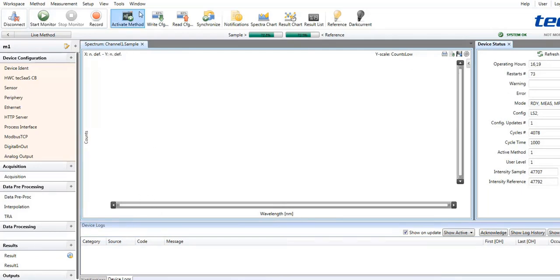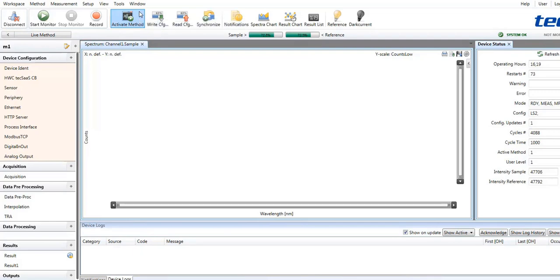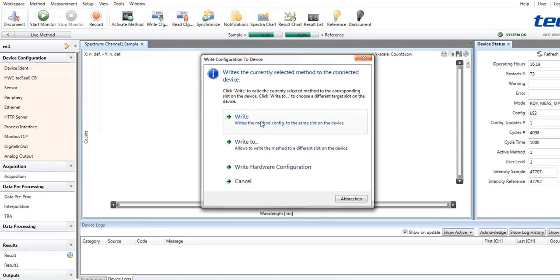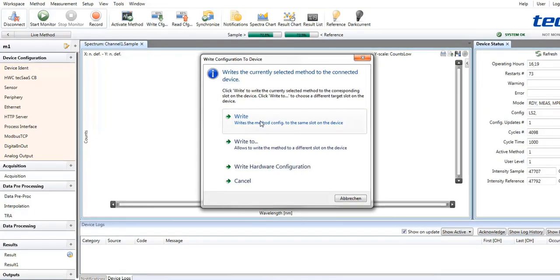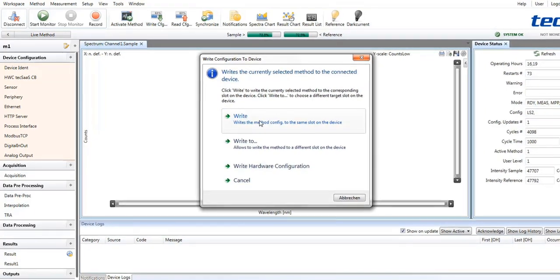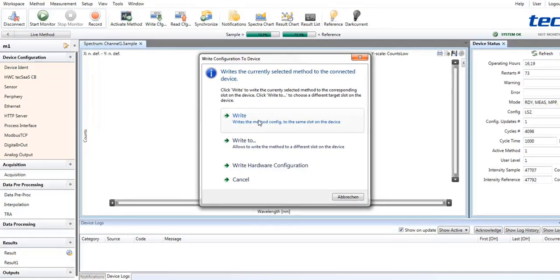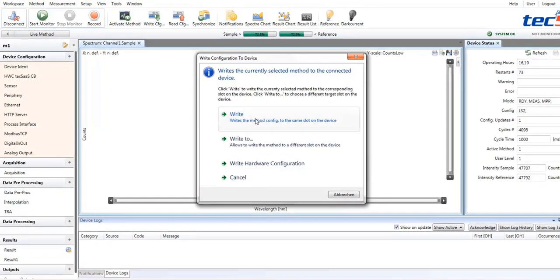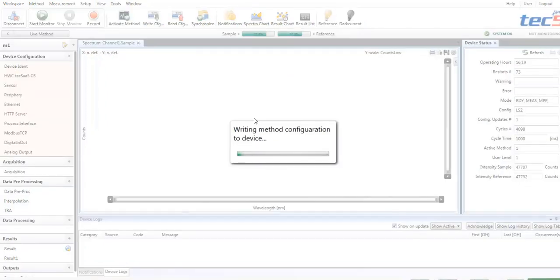Once a method is defined in the left area of the MPT window, this method has to be transferred to the embedded system using the write config button. For example, the method is written to the method slot in the system.